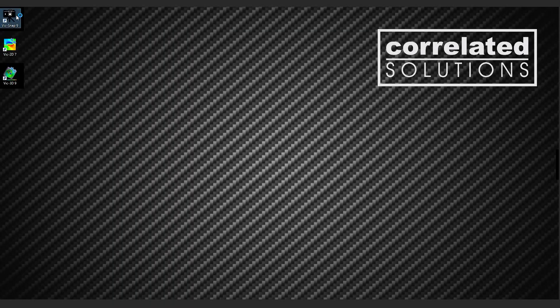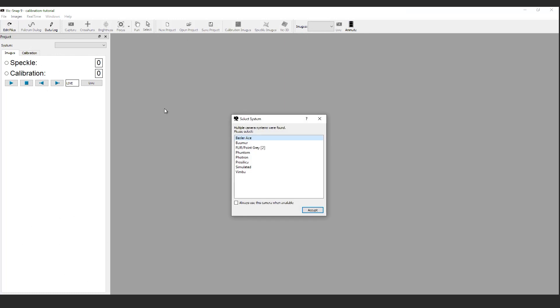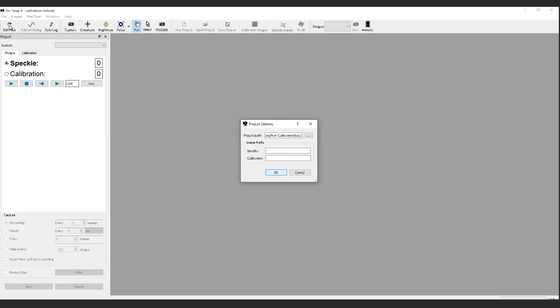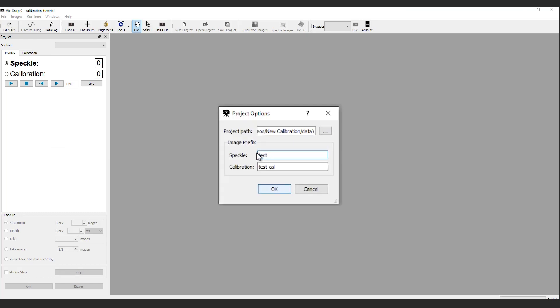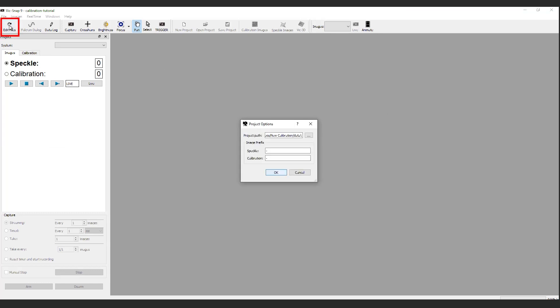When VIC-Snap is first opened, a prompt is provided to select the appropriate camera system. Select the camera system you have and click Accept. This is followed by the Project Options window, which prompts us to enter a filename prefix for the speckle and calibration images and the location for saving the images. In this case, the speckle images are labeled Test1, and the calibration images are automatically labeled Test1-Cal. At any time, if you need to return to the Project Options window to change filenames or locations, just click Edit Files in the menu or toolbar.